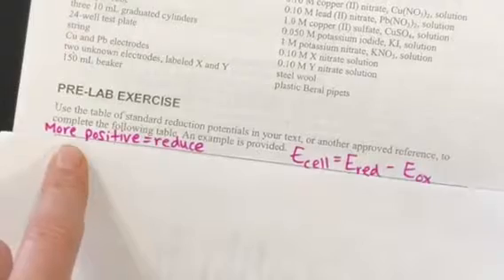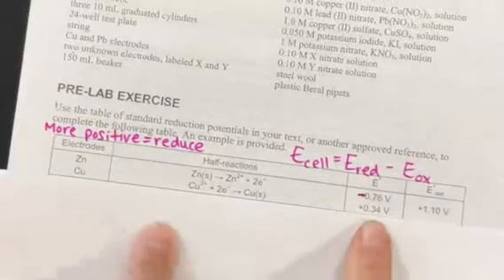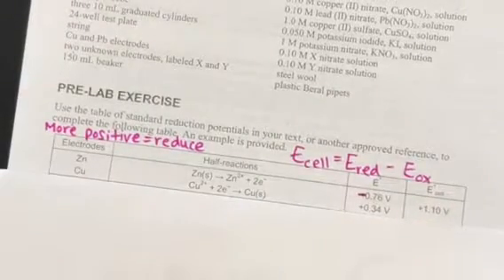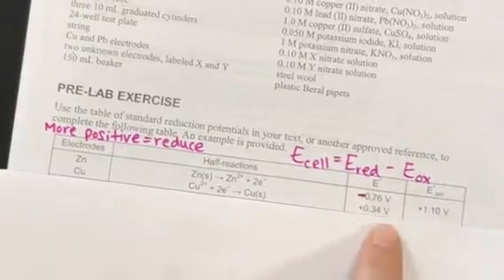So I'm going to show you a quick way. I did change some of the information here that they initially had as positive, and here is how we figure out that this one is positive.